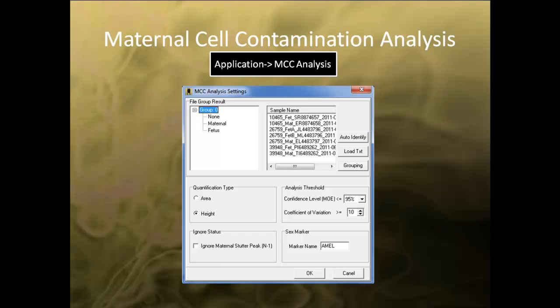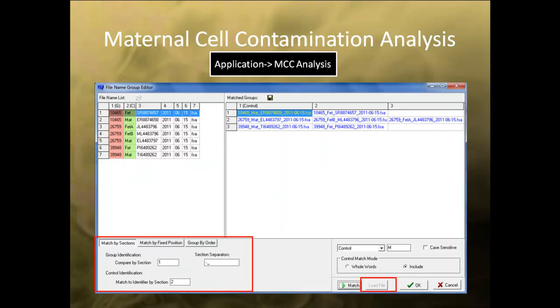Begin maternal cell contamination analysis. First, select maternal cell contamination analysis under the Application tab in the main menu toolbar. In the dialog box, first select Grouping. In the File Name Editor, you can either load a text file or use the Group Identification field at the bottom to group fetus sample with the appropriate maternal sample.